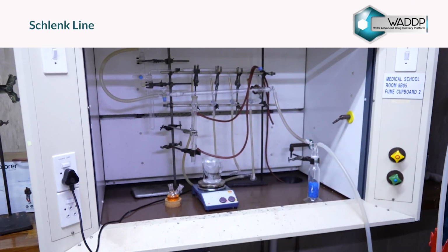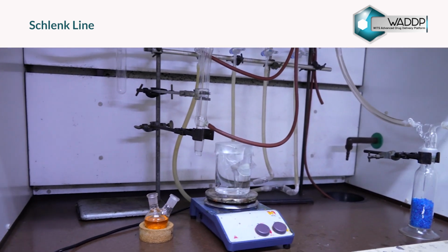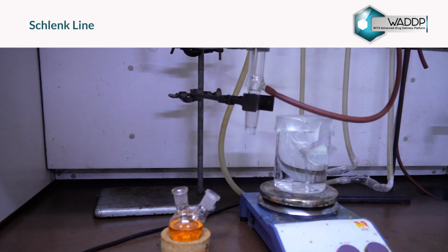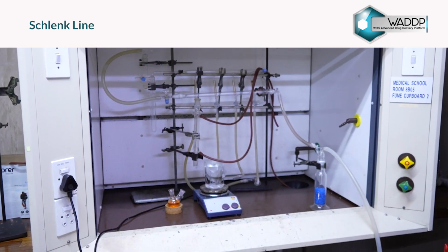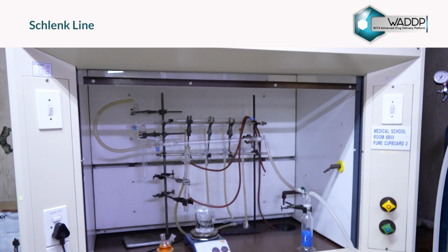A specialized piece of laboratory apparatus used primarily in air and moisture-sensitive chemistry to remove volatile solvents or to dry samples in a vacuum in a controlled atmosphere, amongst other uses.